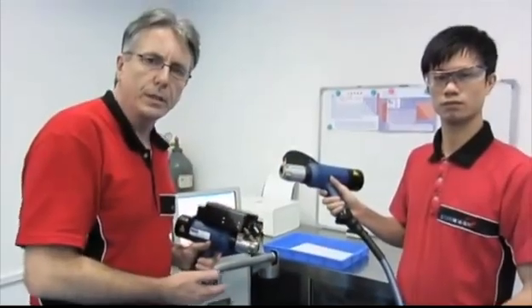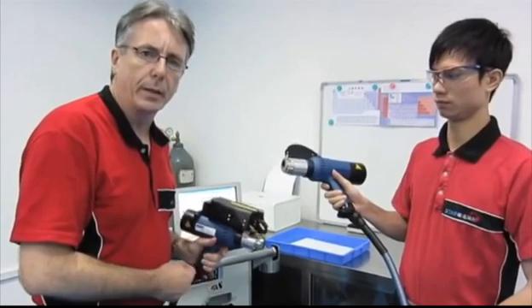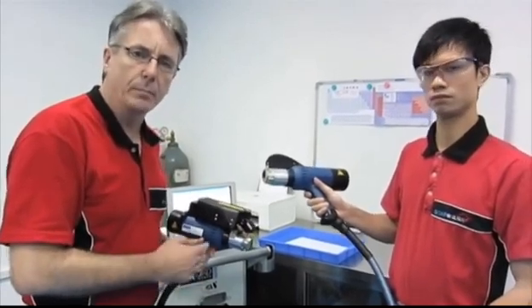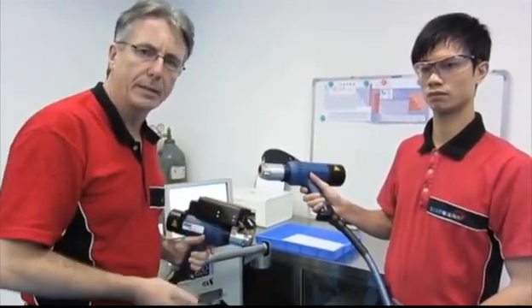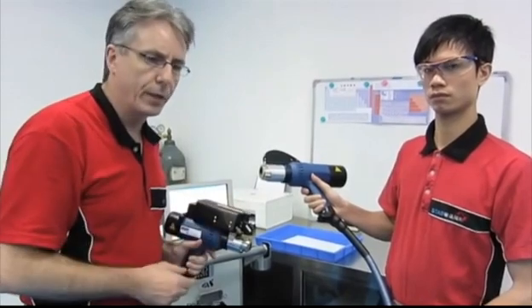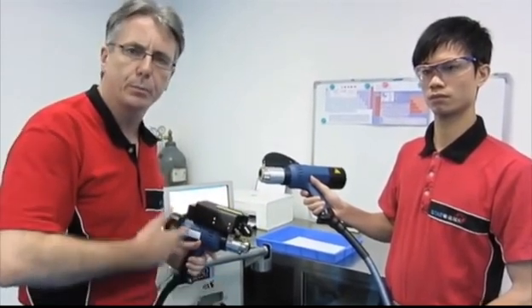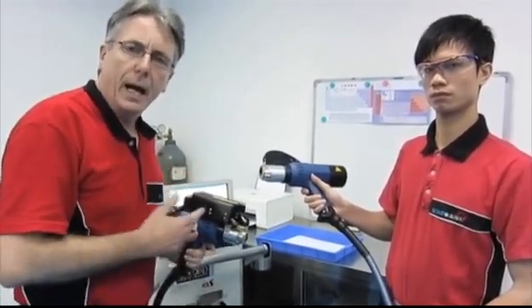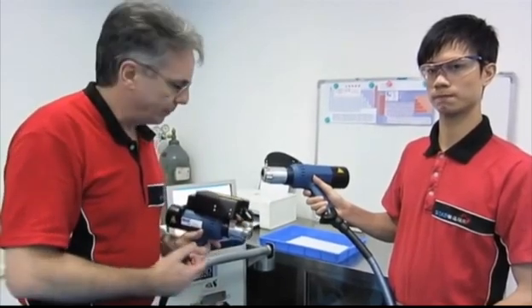We purchased this machine with eight base metal calibrations. So we can measure anything from precious metals, cast-irons, right through to carbon steels, aluminiums, brasses, bronzes, stainless steels and so forth.